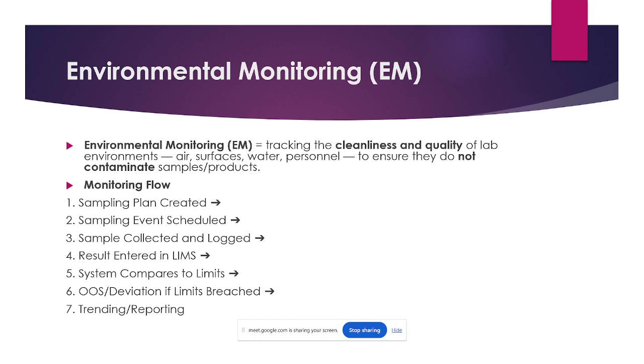One event we need to schedule. After the event is scheduled, samples are automatically generated and we need to collect them. Once the samples are generated, we need to collect and log them. Once we collect the sample, we need to receive it. Once received, we need to perform the analysis. Once they perform it, you will enter the result in the components.